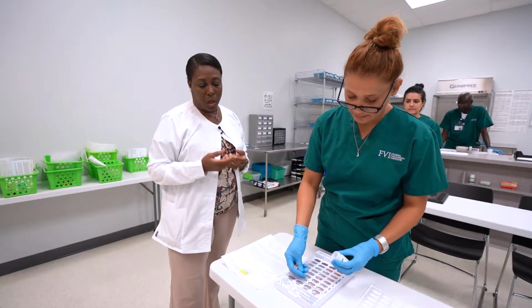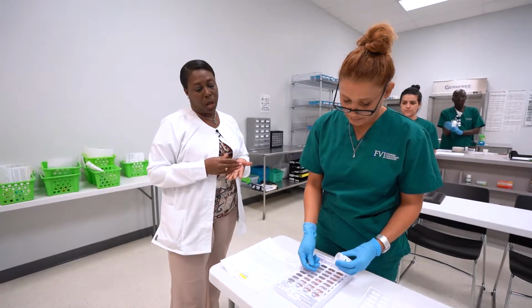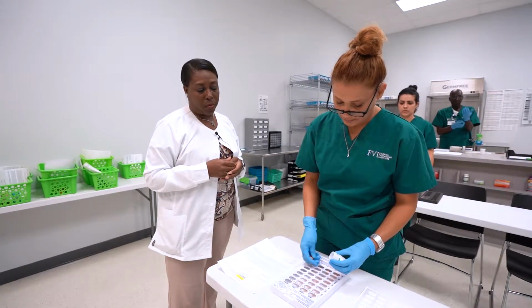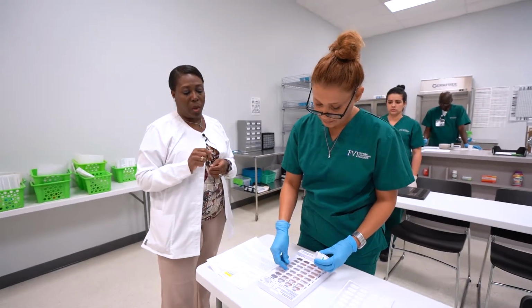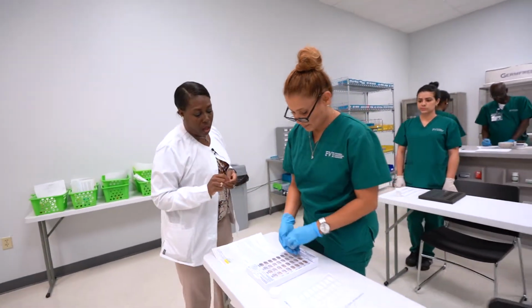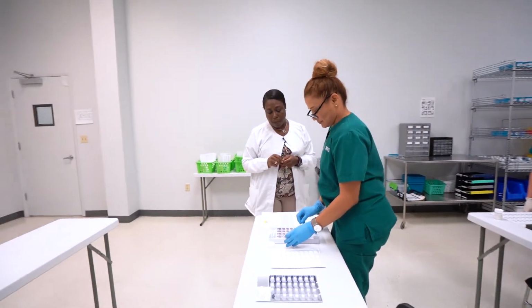So we have to make sure that we read the prescription, because sometimes we may have to cut the pills in half, but in this case she does not have to count them. She's entering one in each slot. So one thing we have to remember is that we have one medication in each of the slots.